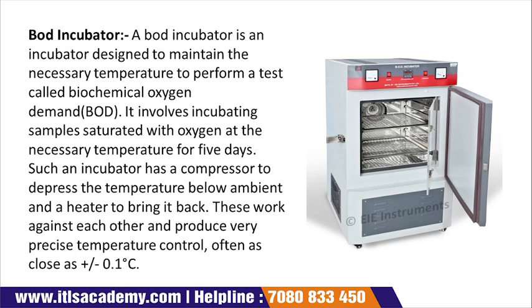Now the incubator. As we all know, the incubator is used for microbial growth because it gives the proper environment for the growth of microorganisms, like temperature, humidity, concentration of carbon dioxide, etc.